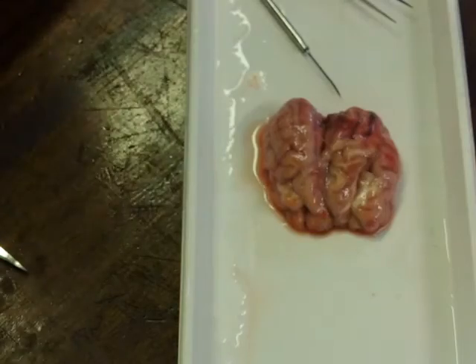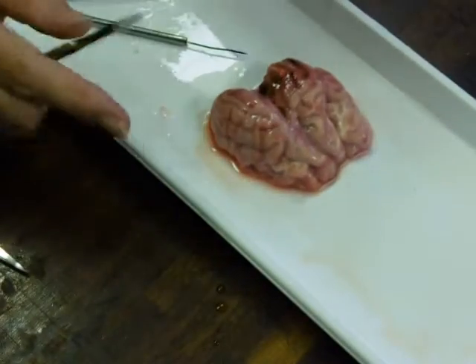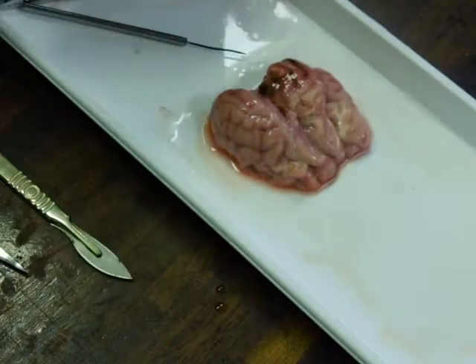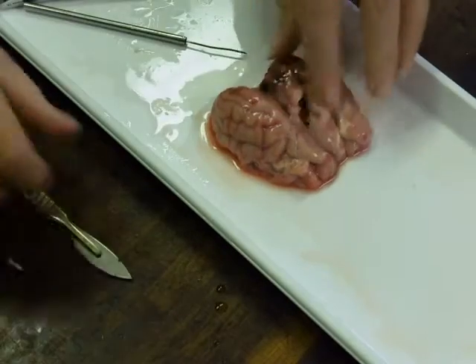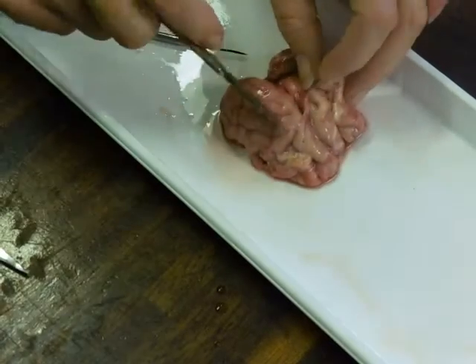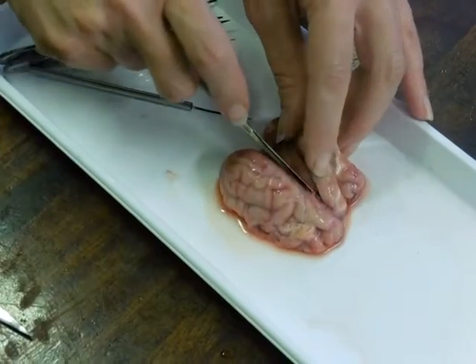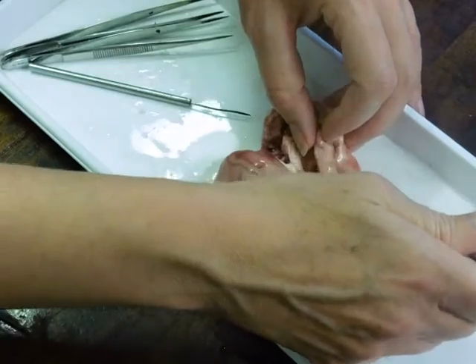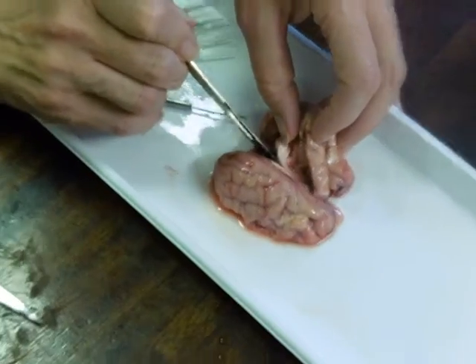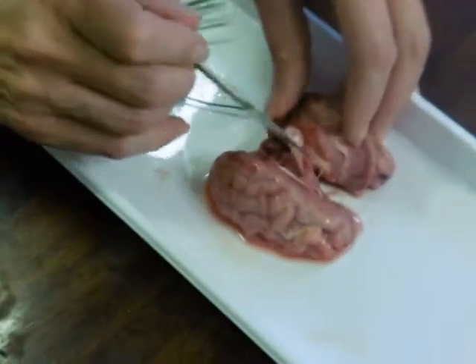Right, I'm going to use a really sharp scalpel. So we've got the 2 sides of the brain, I think, because I've never seen one until this morning, and it was still frozen. Just chop it in half, see what happens. It might still be a bit frozen, I don't know. It's already been split a bit there, and how do they get it out of the lamb? I don't know. Wow. I want to see.